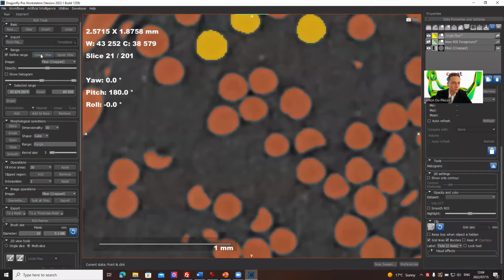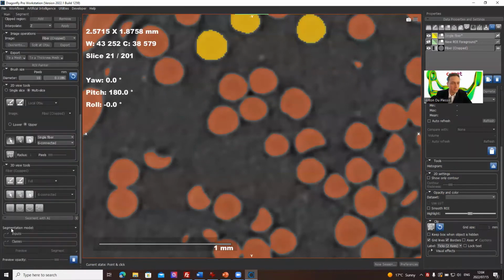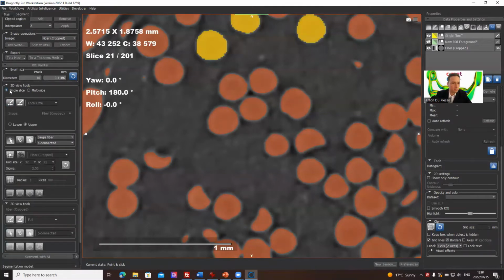What I wanted to demonstrate here is, if we have a single, let's say we have some region painted.